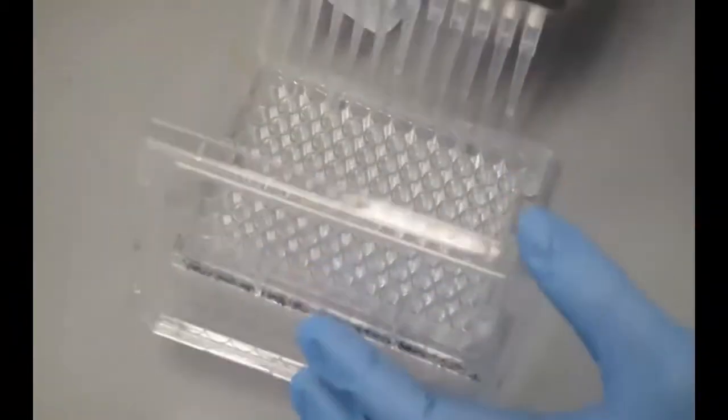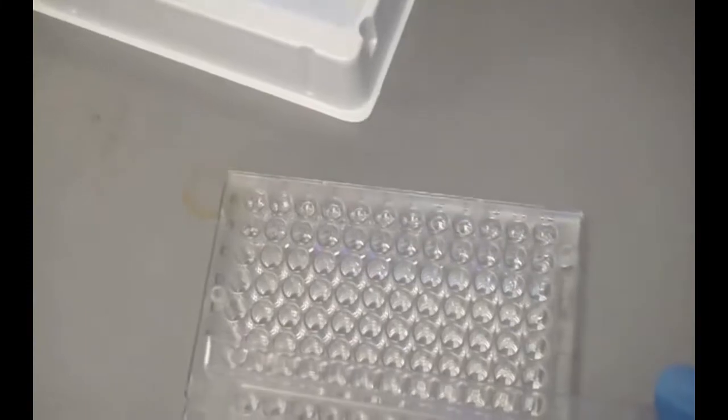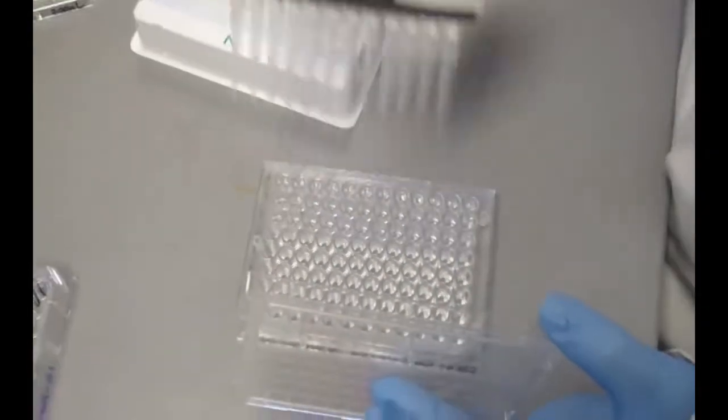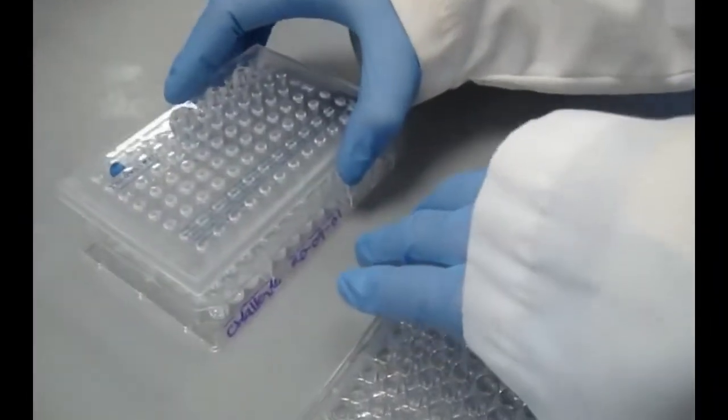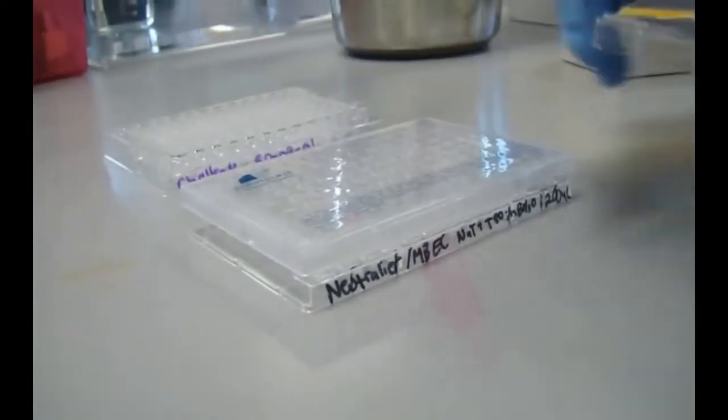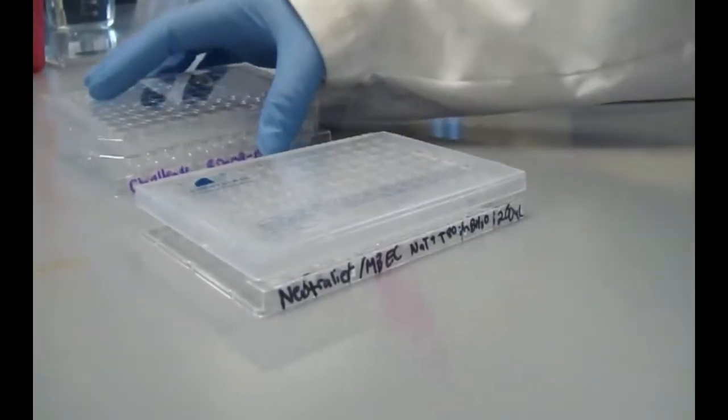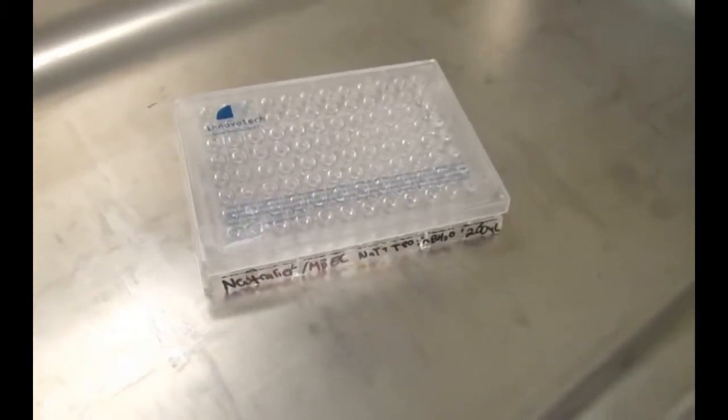The recovery plate is prepared by adding 200 microliters of appropriate neutralizer to each well of a new sterile plate. After the appropriate challenge time, the peg lid is transferred to the recovery plate. The whole device is sonicated for 30 minutes to remove the attached biofilm.